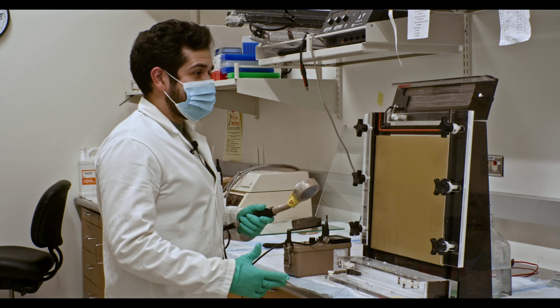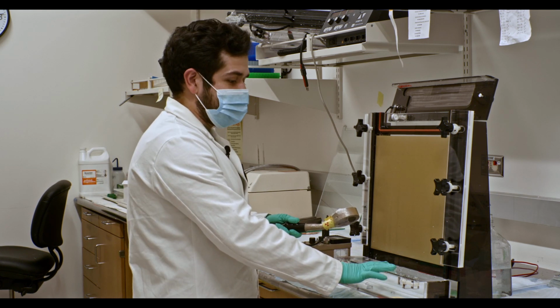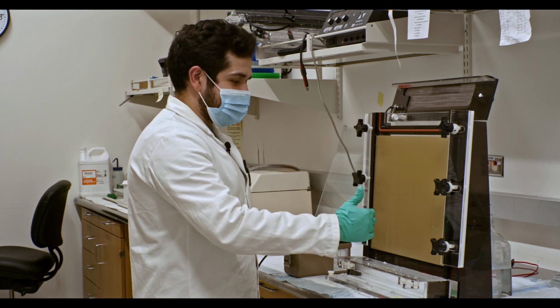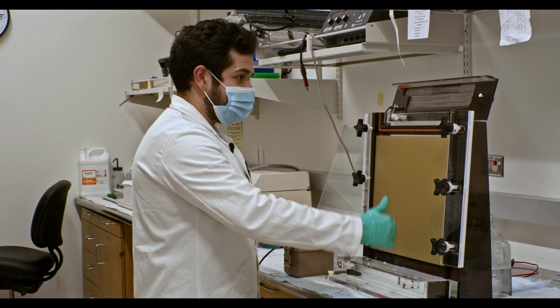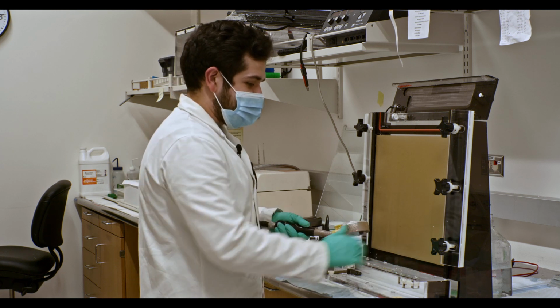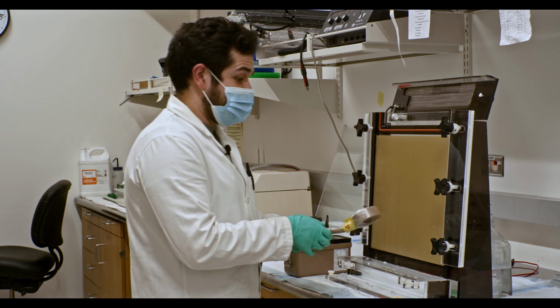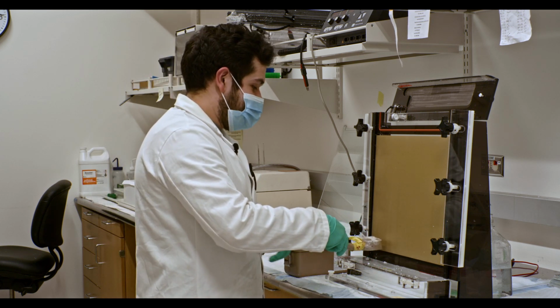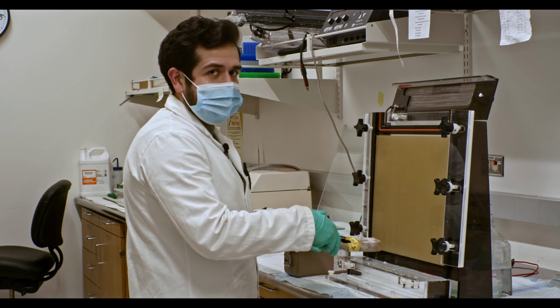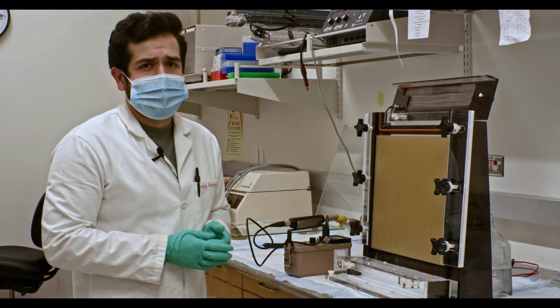The next thing that you should do is actually test the running buffer that's at the bottom of the gel apparatus. Whenever you run your gel, the radioactive DNA and sometimes the radioactive phosphorus that you couldn't get out can run and will run faster than the rest of the material on the gel. And so it could have leached into this bottom TBE container. And if so, then that means we have to get rid of it in liquid waste that's radioactive. But as you can hear from the Geiger counter, there's no rapid chirping, so there is no radioactive material found in this TBE. So we can dispose of it just like any other TBE. We just throw it into HPLC waste, for example.